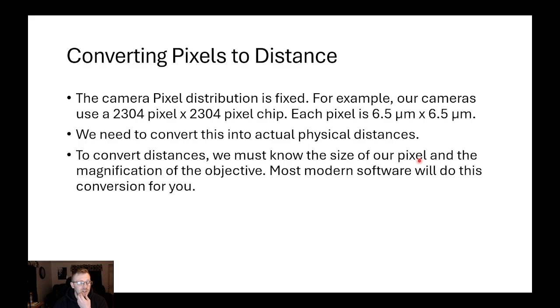So the first thing we need to do, right, is we need to be able to generate a real scale of the image you're looking at. Again, pixels are defined as the size of the photodiode. Cameras see things in pixels. So what the camera knows is how many pixels were used to identify an object. So if you have a bacterium that is 3 microns long, the camera doesn't read that as a 3 micron long bacterium. It reads it as a half a pixel long bacterium.